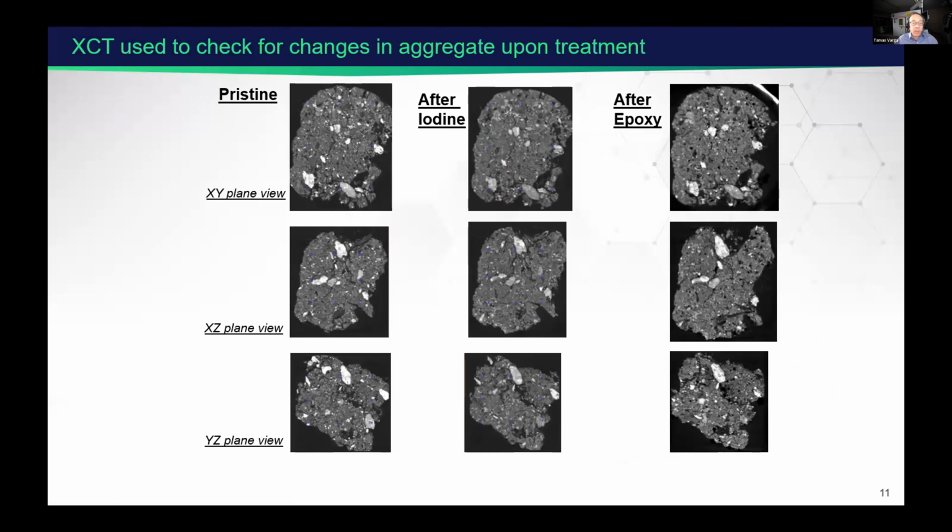This project basically uses X-ray micro-CT combined with SEM-EDX to create chemical maps. The CT was used first to check the integrity of the soil aggregates during the treatment. The treatment is first iodine exposure. We try to use iodine to make the organic matter more visible to X-ray, and then we do embedding in resin epoxy so that we can section thin sections of the sample for microscopy.